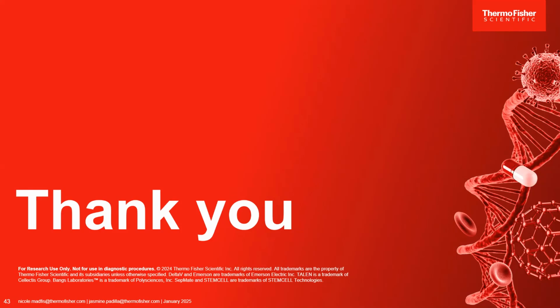All right. The next one here is what is the sample throughput for CytPix? Hi, I can take that one. So the CytPix can use tubes or plates.